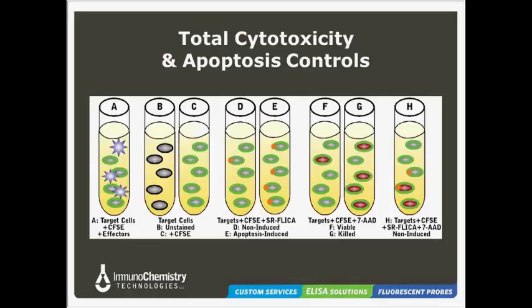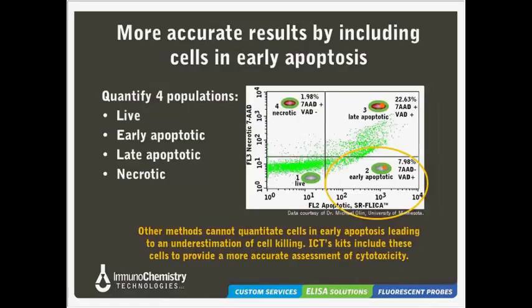Thank you. Someone else is wondering a general question about apoptosis, but why not use annexin V to label apoptotic cells instead of using a caspase-based inhibitor?